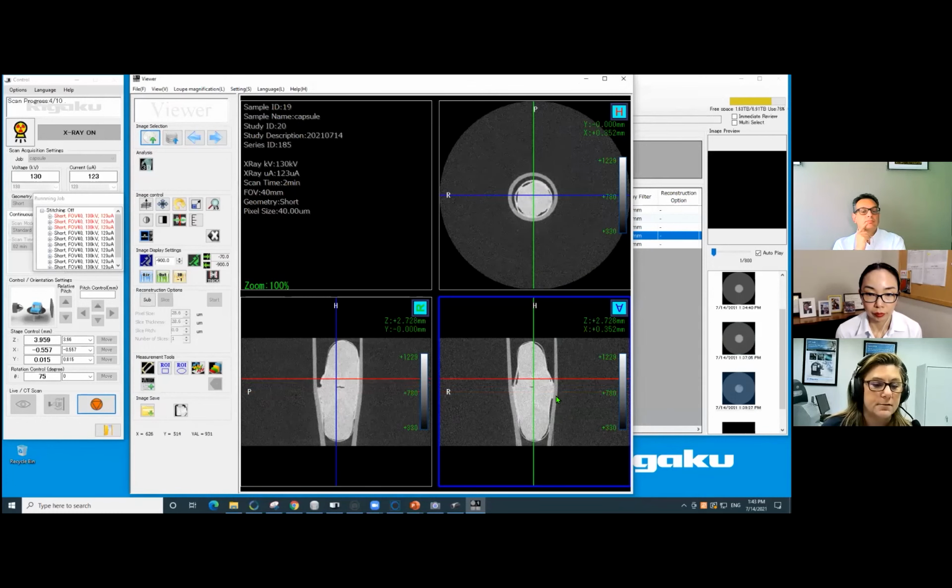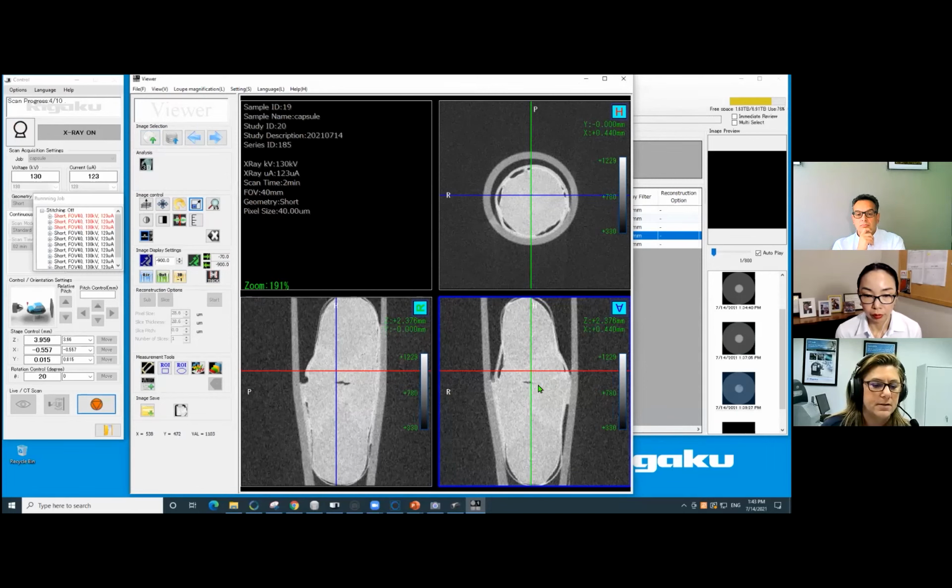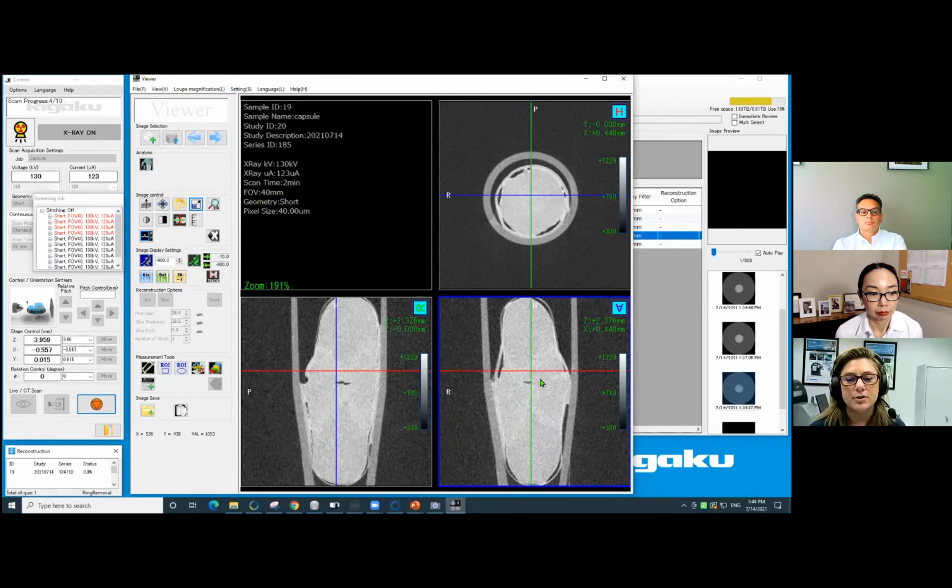Oh, now there's a lot of change happening here. We can definitely see that there's a gap. As we expected, we are seeing the pill dissolve basically from the middle outward. And we see the buckling of the cap material around the pill, and it's starting to dissolve. So if you were taking this pain medication and you had a horrible headache, then at 6 minutes you'd be starting to release some of the active ingredient and relieve your pain quickly.